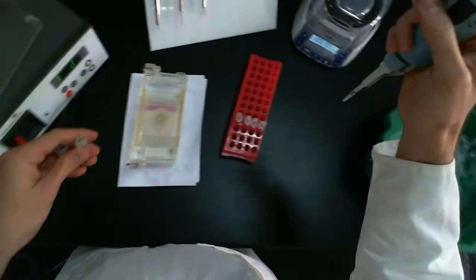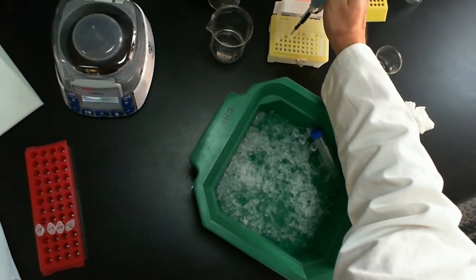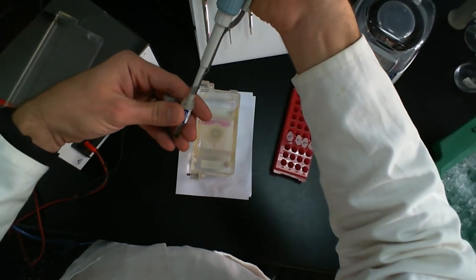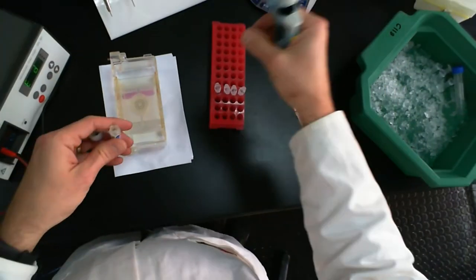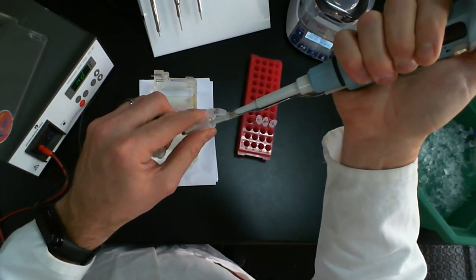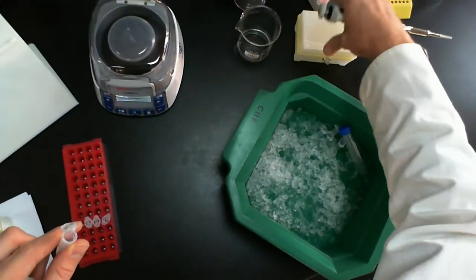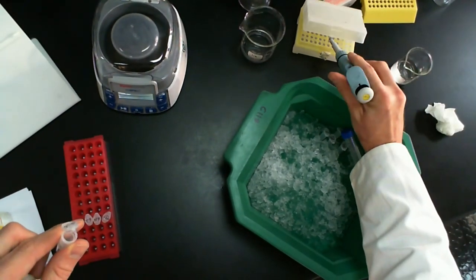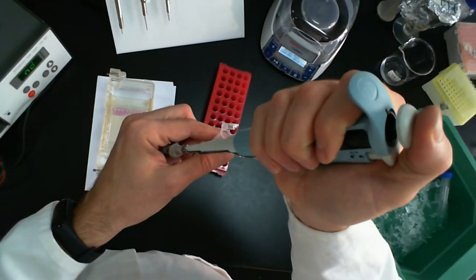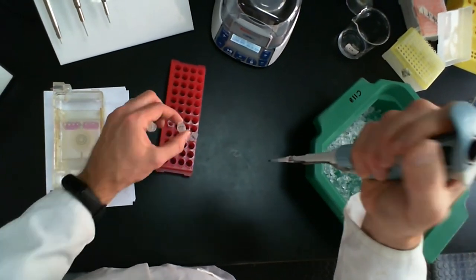So I'm going to bring this up, and oh, where are my tips? Okay, so I'm going to go into tube 1. Do this really quickly. Oops. That's tube 1 done. Tube 2.